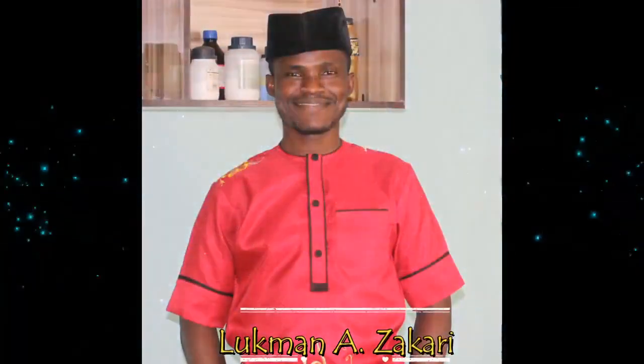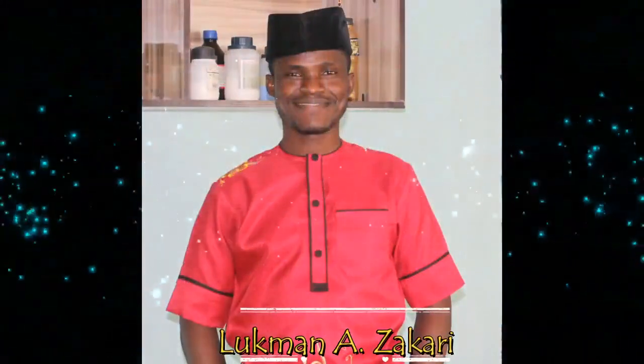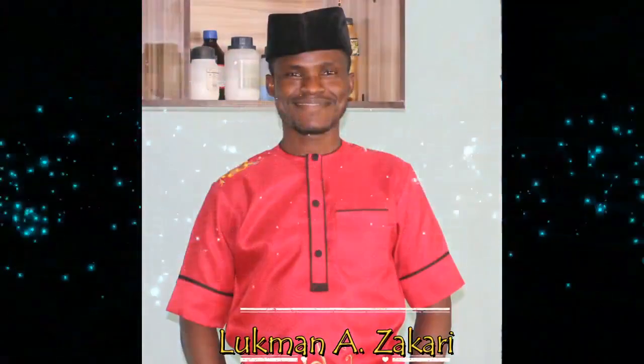Today we are going to be taking a look at basic laboratory equipment, especially for chemistry, and their uses.